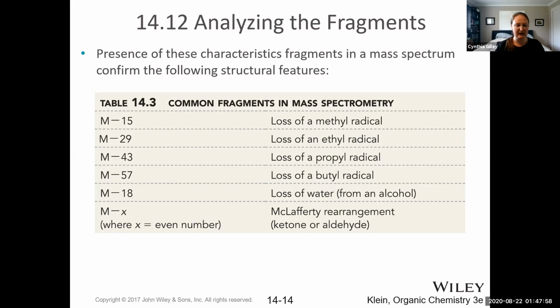This is more of an advanced organic chemistry class where you might do a lot of pathways for fragmentation. But also now we have more gentle methods of ionization, which allow the molecules, as a molecular ion, to reach the detector without fragmenting. And so we don't really need to do an analysis of fragments, which actually makes the analysis of a mass spectrum much easier.